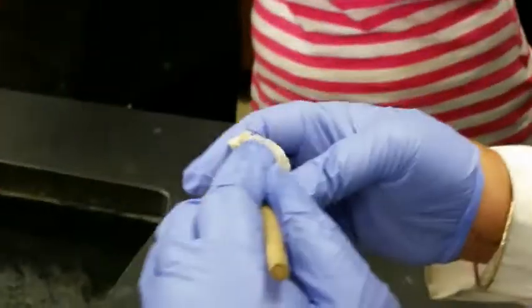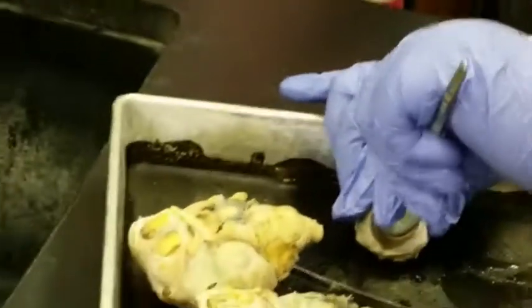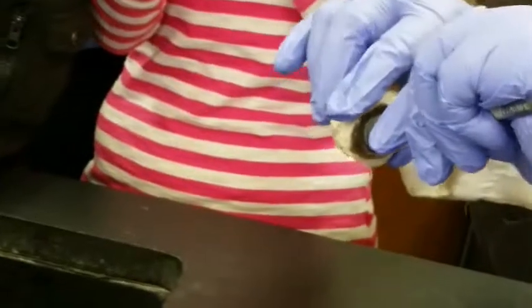Now, this should be easy. Cornea. And what is this? The sclera. And so now we do some dissection. So I'm going to cut in front of the lens. So expect to get some fluid. Oh, so you see all that fluid that's coming out?